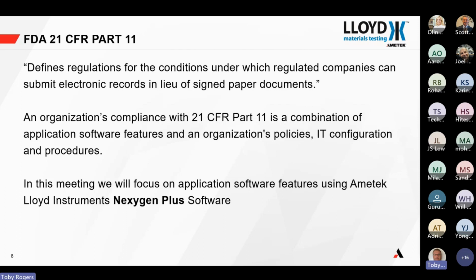It's an organization that needs to be compliant, and there are many interlinking factors outside of the laboratory software. And in this meeting, we're really going to focus on application software, instrument application software in the laboratory. And we'll show some of the features in there that will help you link into your organization's policies and IT procedures.